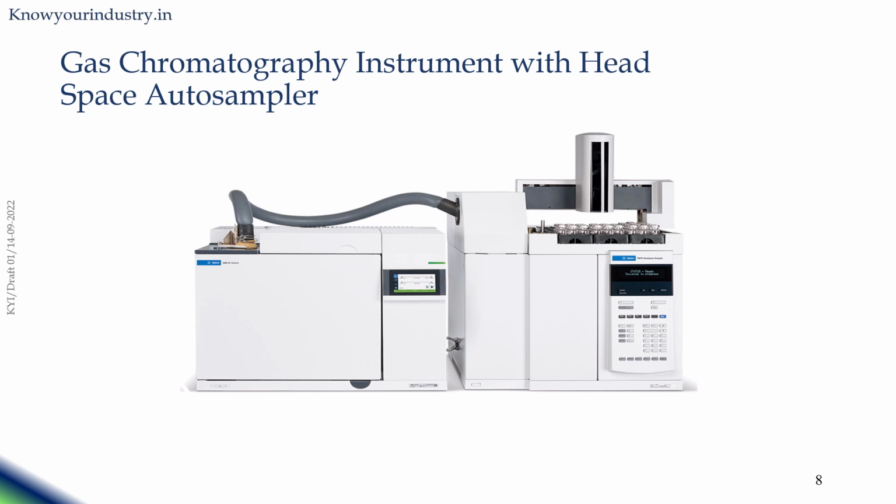This slide shows another gas chromatographic instrument with a headspace auto sampler. In the previous slide, what we have seen is an auto sampler used for liquid samples. Here, the headspace auto sampler is generally used for highly volatile compounds, and you can apply the sample directly inside the headspace auto sampler vial. In the headspace the sample gets evaporated, and the vapor of the sample will be injected into the column along with the mobile phase.